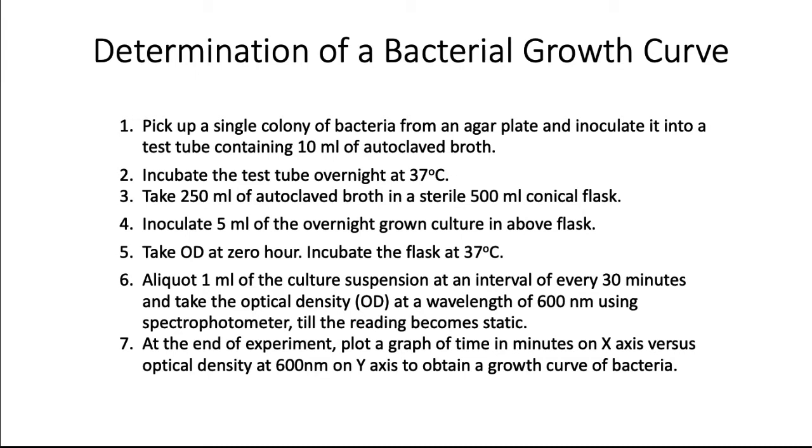In the next slide I'm going to talk about spectrophotometry, but optical density in this case is going to reflect the turbidity, the cloudiness of your broth. So clearly, if you have very few cells, your broth is going to be more or less transparent. But as you have more and more cells, your broth is going to be cloudier. By measuring the optical density at a certain time interval, in this case every 30 minutes, you'll be able to plot those numbers. And ideally, you would be following the exponential growth curve.